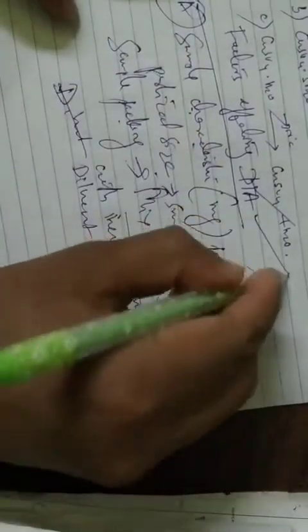And finally, diluent is also sometimes used. The diluent is an inert material, as in the previous example where we saw that nitrogen gas is being used. So this is the main thing we are going to see in sample characteristics. These are the factors that usually affect the DTA. Whatever we have seen in sample characteristics: the powder form, small and uniform particle size, and sample packing with finely grained material, is very important. If we make a mistake in these sample characteristics, we will definitely not see the DTA curves in a good form.